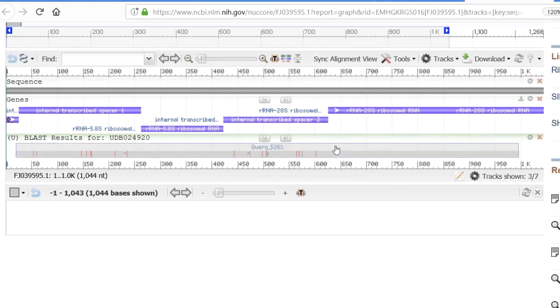So for example, we could think about doing a search against 28S, but they're more conserved in the regions down here that we're interested in. And you can see that basically right here by looking at where the mismatches are. We've got mismatches in the ITS regions, nothing really within the 5.8S, and nothing really within the 28S. But it does tell me that my sequence is longer than just the ITS region.